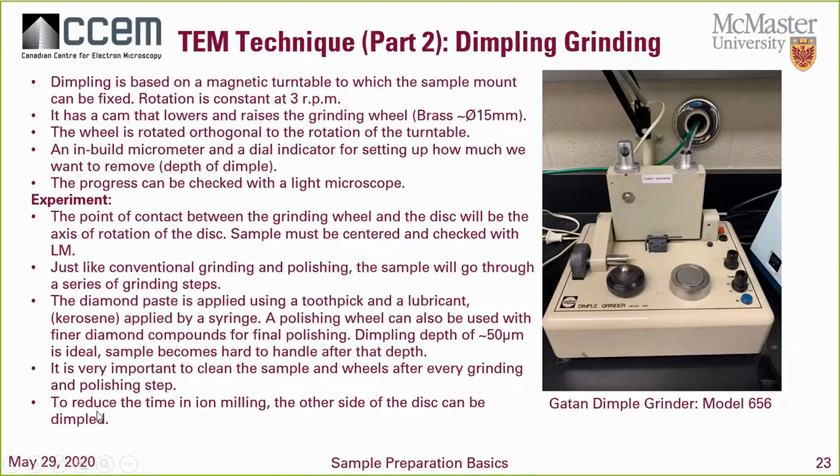Now it's, again, to reduce the time, right? Like I said, dimpling the other side, but recommended for those beginners, just dimple the first side. You can go deeper if you're just doing one end, right? So maybe instead of 70 or 80 microns of dimpling, maybe you can start there.